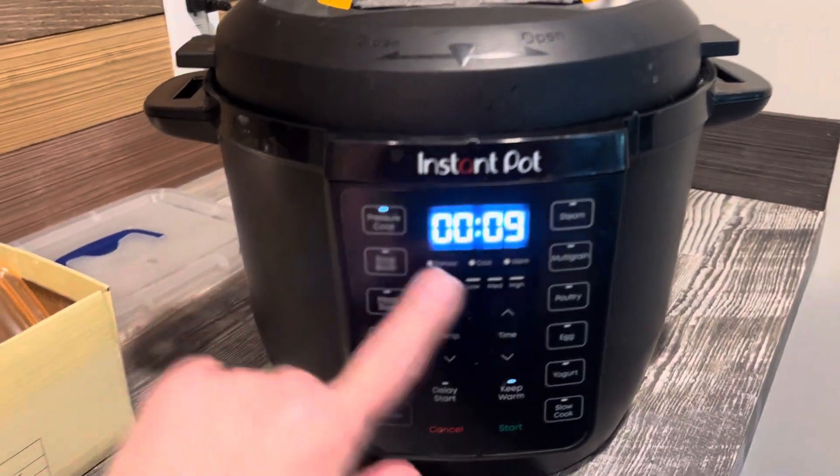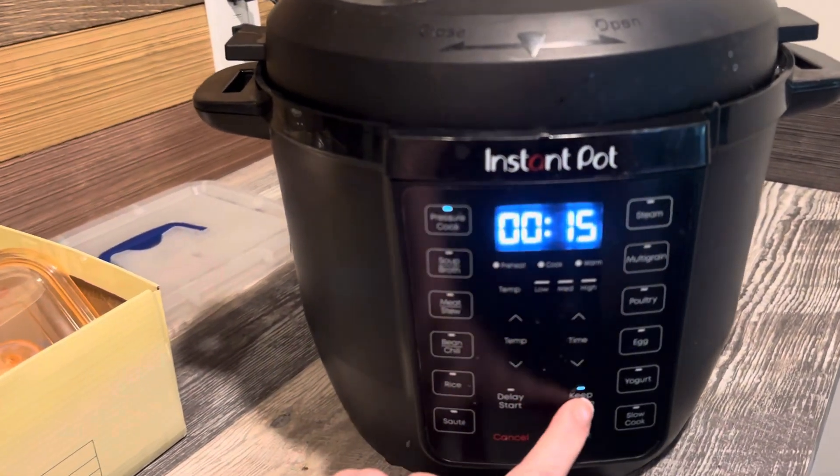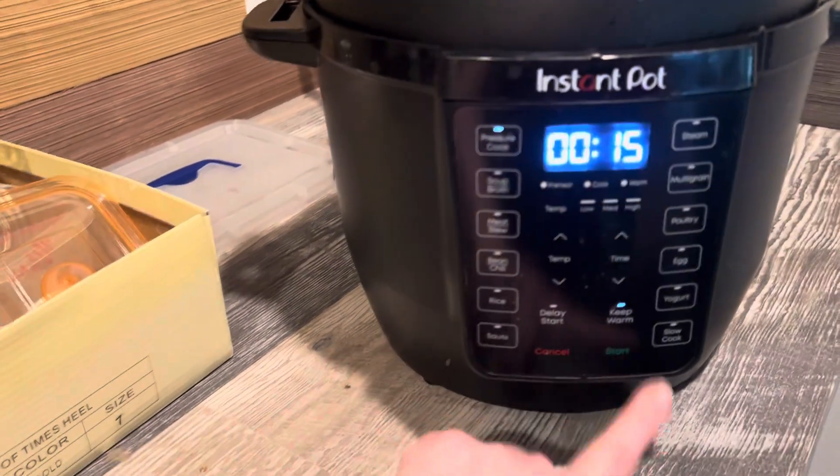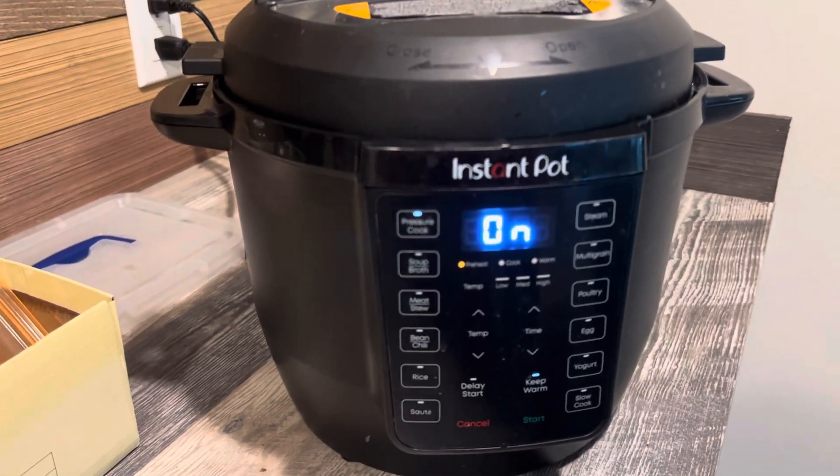Alright, so I'm just going to set this for 15 minutes. I'm going to leave this on — I usually turn this off except for this — and I'm going to push start, and then I can come back to this even in an hour.